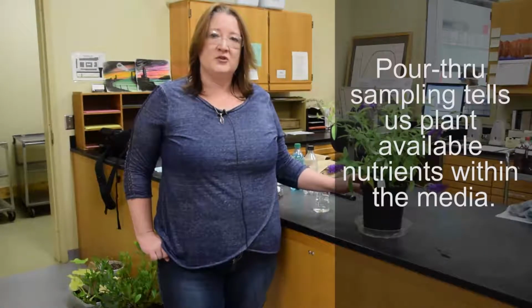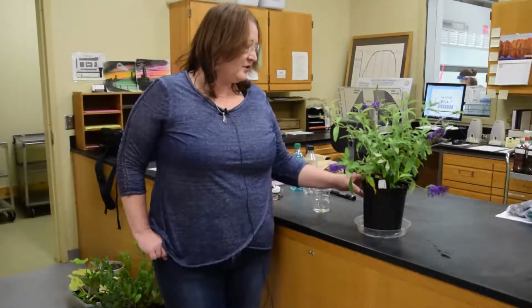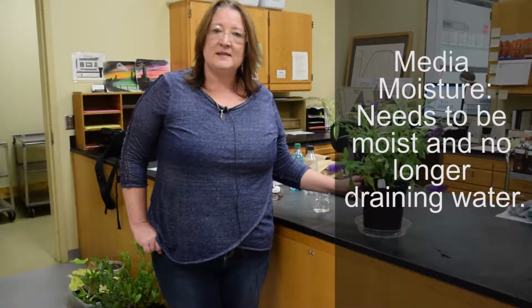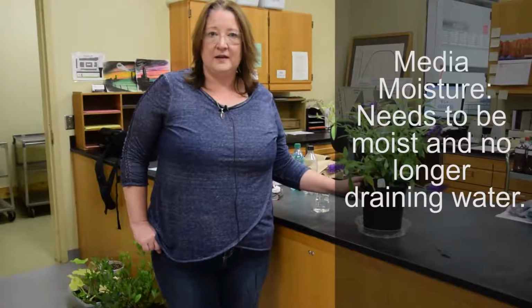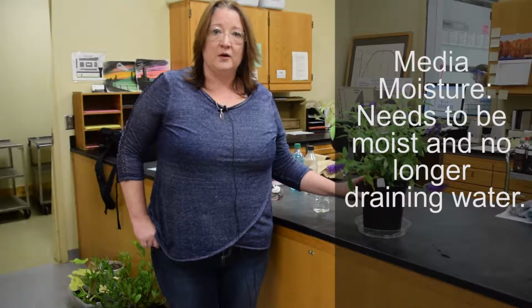Next, we are going to demonstrate how to take a pour-through media sample. The purpose of the pour-through sample is to determine the concentration of plant-available nutrients in the media itself. The first thing you do is you make sure that your plant is evenly moist but not overly saturated. It should be fully moist but no longer draining water.